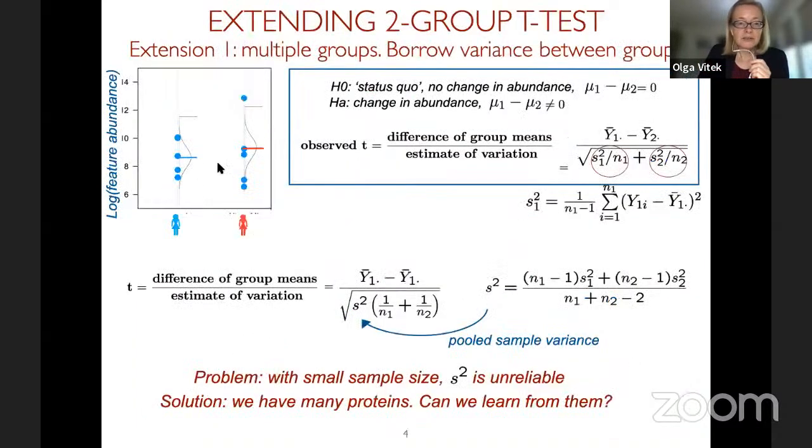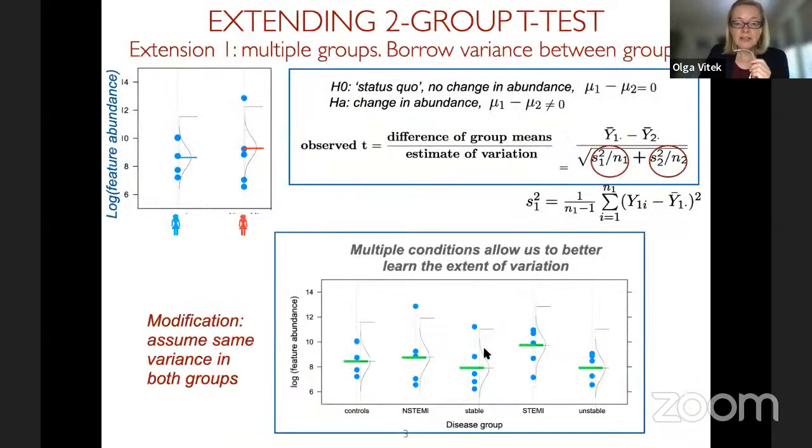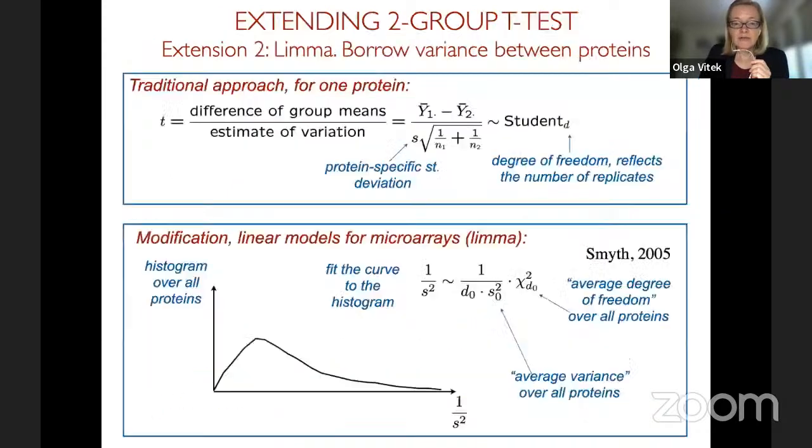So to summarize, what Limma is doing is that it improves the stability of variance for comparisons such as two-group comparison or analysis of variance comparison. It is a good idea, it is helpful. What Limma does not do is account for differences in the signal. So it still assumes that all of the points that we have are independent, and it does not account for more complex structures of experimental design, which have some kind of similarities between observations, such as time course data, or paired designs, or repeated measurements, or mixtures if we have a multiplex experiment.